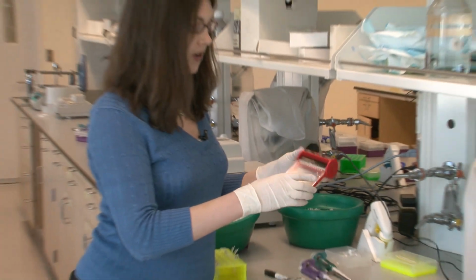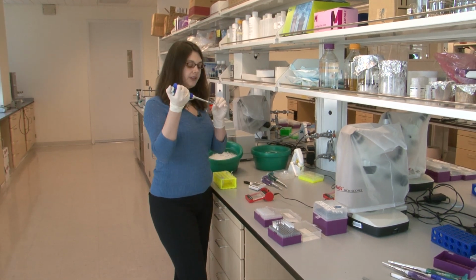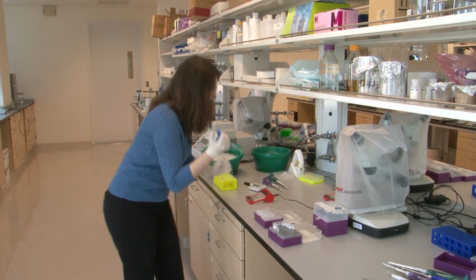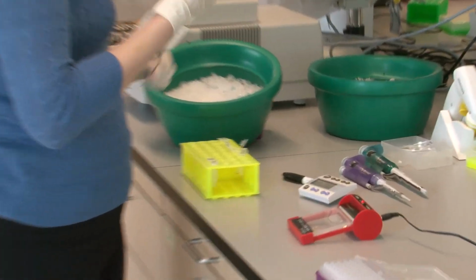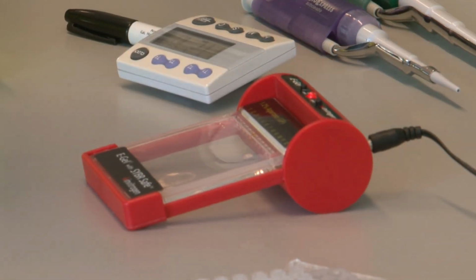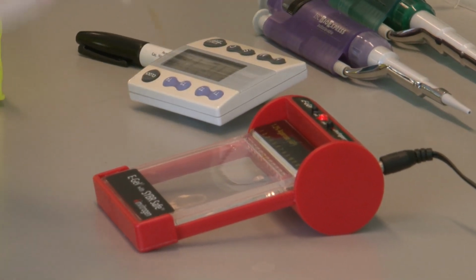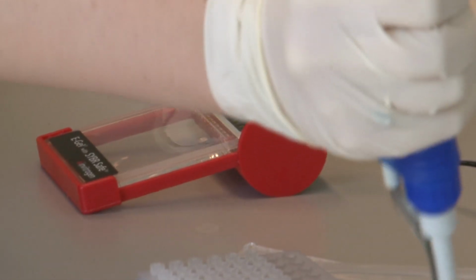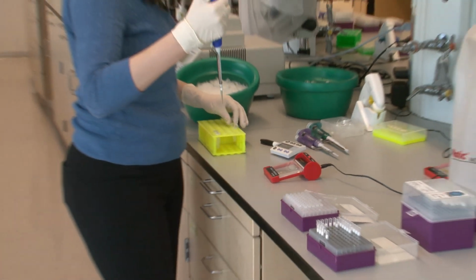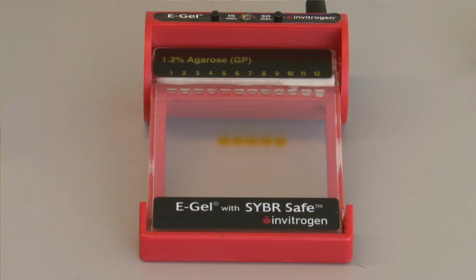So I'm going to put the gel down onto the lab bench. And for each one of my DNA samples, I'm going to load them into one hole in the gel. So I'm loading my DNA samples of the different people individually into each hole in the gel. And the orange dye helps me to see that I've actually successfully gotten the DNA into the hole.